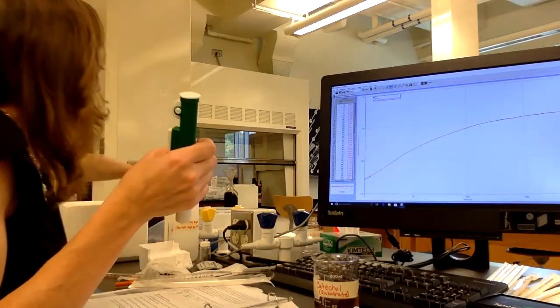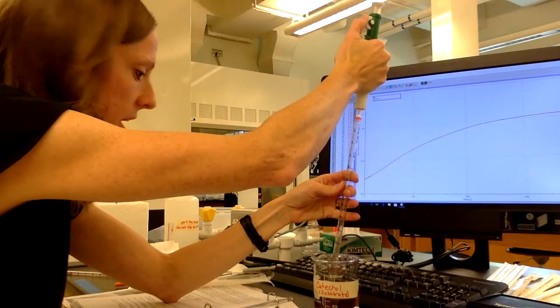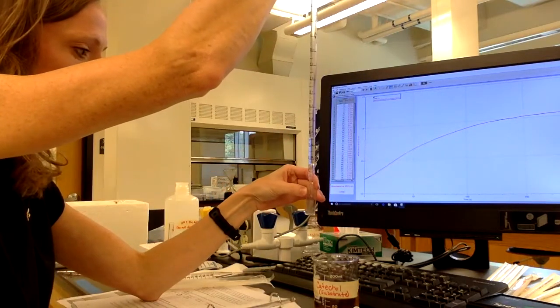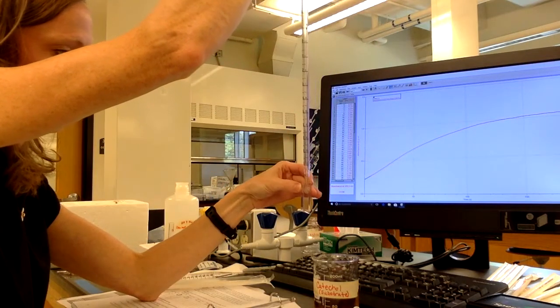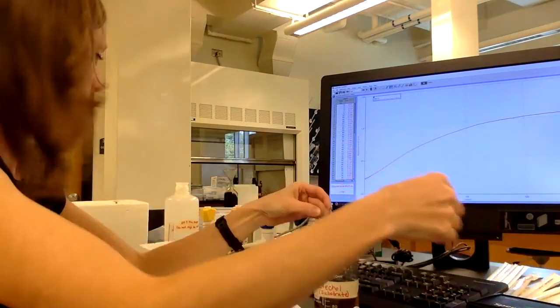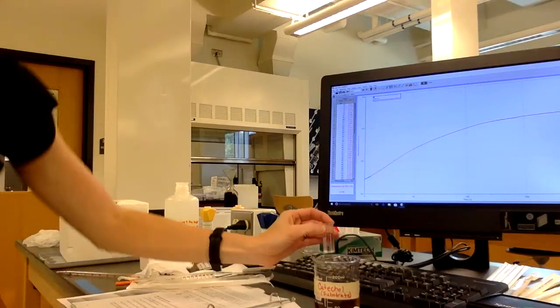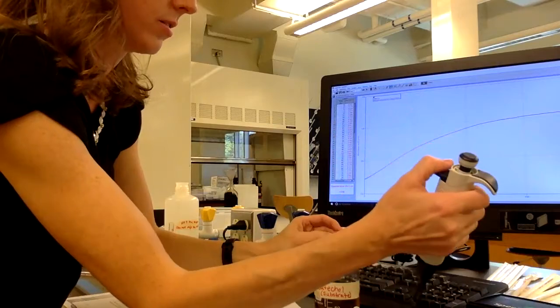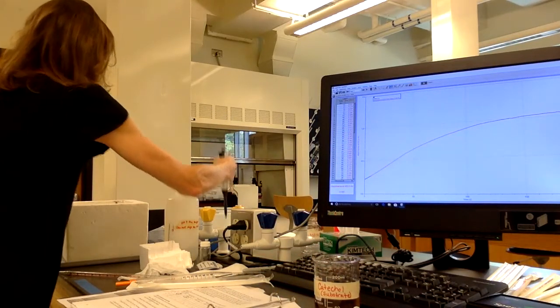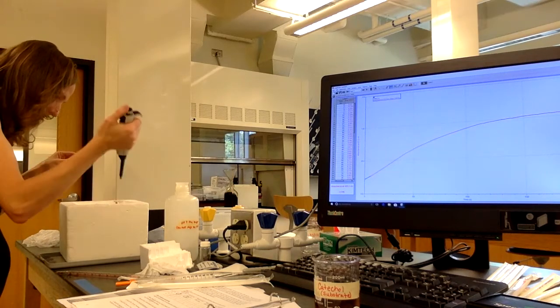All right, so to do the reaction again, I just diluted my enzyme. I'm going to take 3 mils of the catechol, take a fresh cuvette, okay? Put my 3 mils of catechol in there. And we are going to combine it again with 50 microliters of the now diluted enzyme, which is 50 units per liter enzyme, okay? I have that here. I should put it on ice.